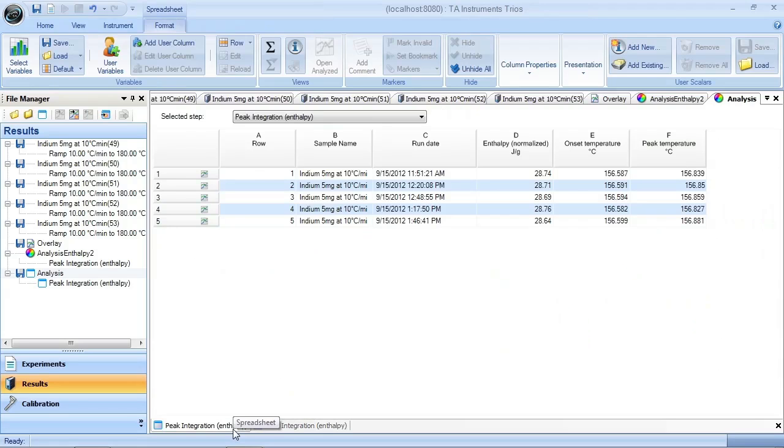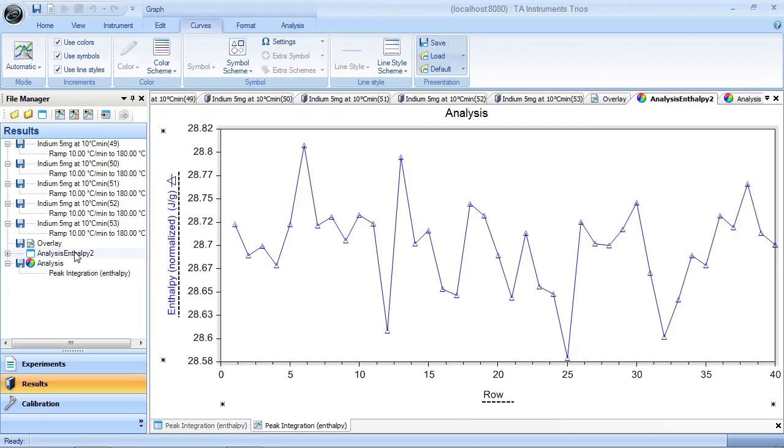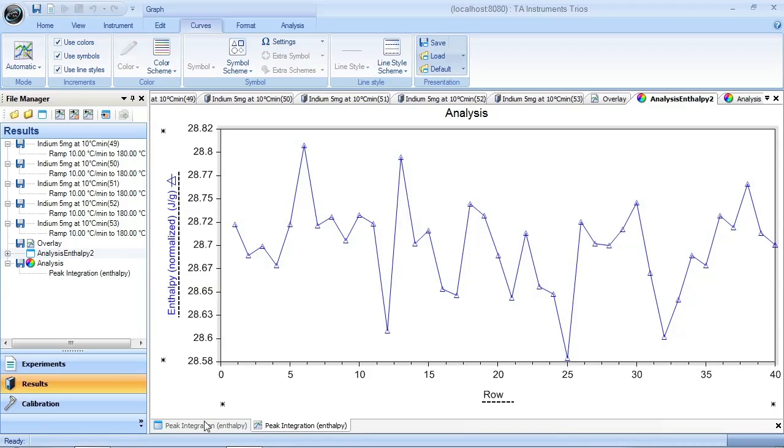But suppose I want to add these results to other results I already have. I have here another analysis report I've created, and this has eight sets of five indium melts. So there's 40 sets of data here.